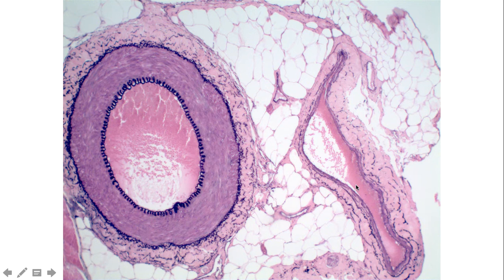Now that's not always the case, but it tends to be the case in the slides that we have, where the lumen of the veins tends to be collapsed, whereas the lumen of the arteries tends to retain its circular shape. And this is primarily due to the thickness of the supportive walls that make up the artery compared to the walls of the vein.